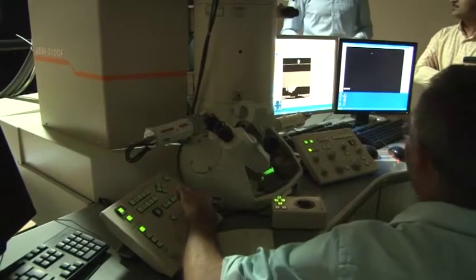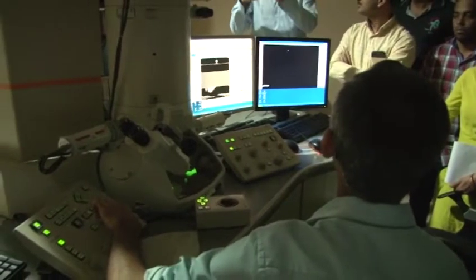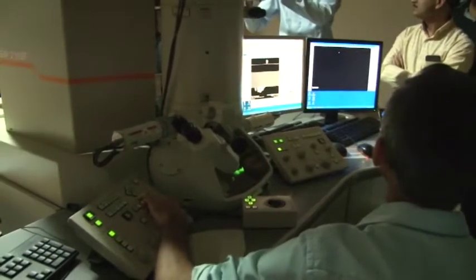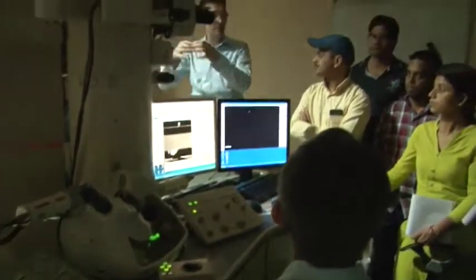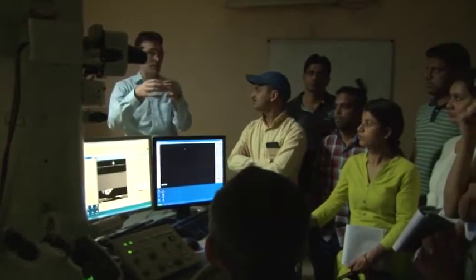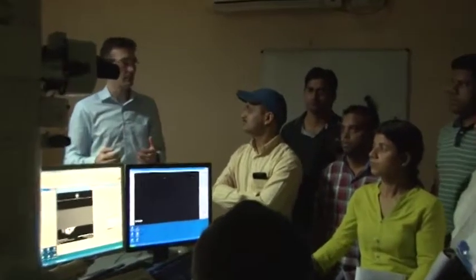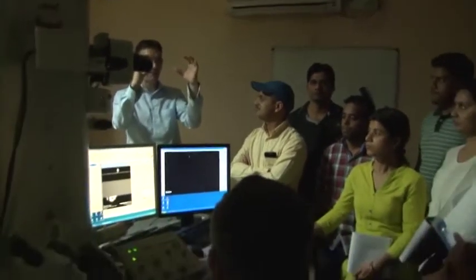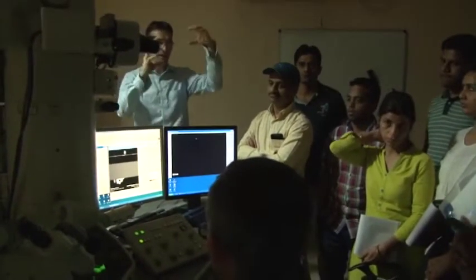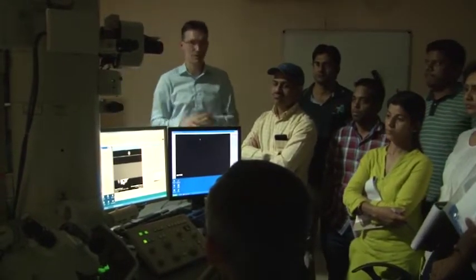Balaji is going to tell you about that tomorrow. If you want to do dark field imaging to select a diffracted beam for optimal imaging, you want to shift the beam in the diffraction plane back to the optical axis. But how can you shift the diffraction pattern? You shift the diffraction pattern by tilting the beam, keeping the sample constant. And you have to realign the sample as well to keep the excitation conditions. But I'm just going to tell you that tomorrow.